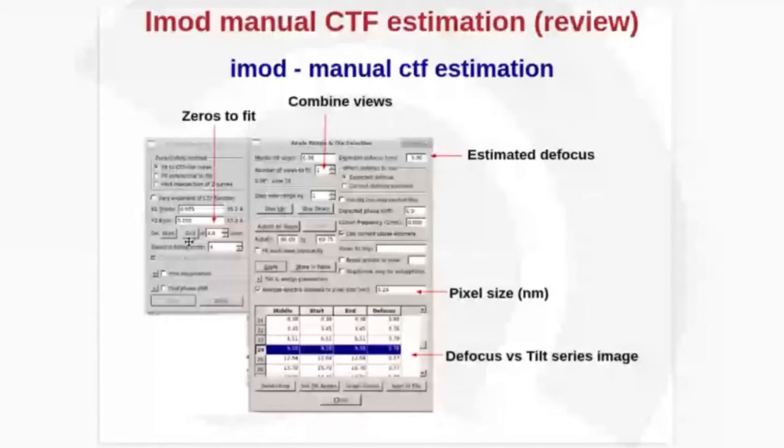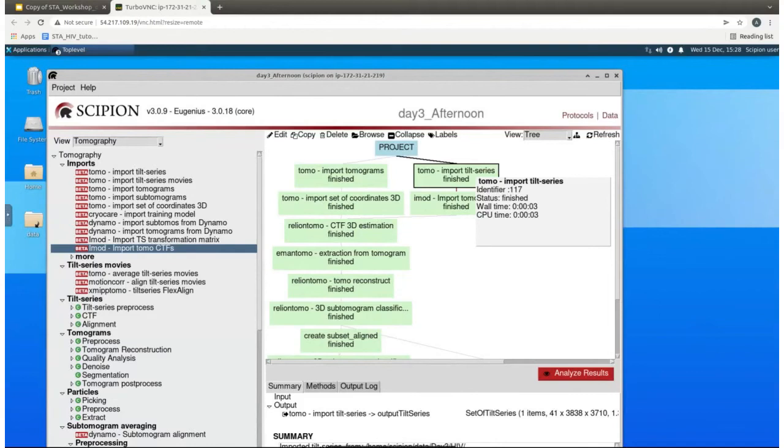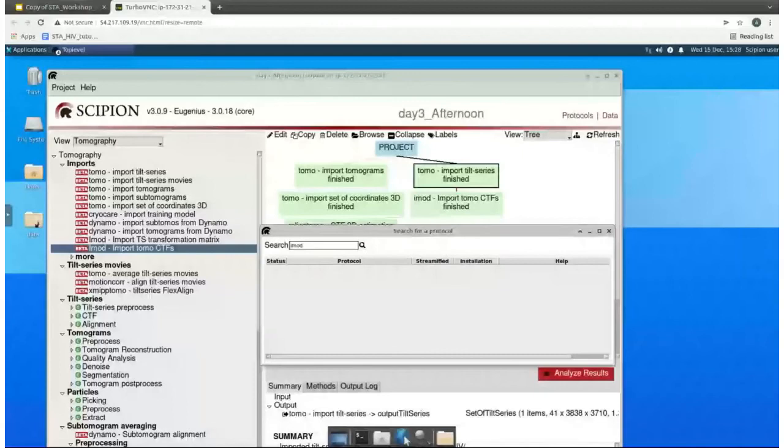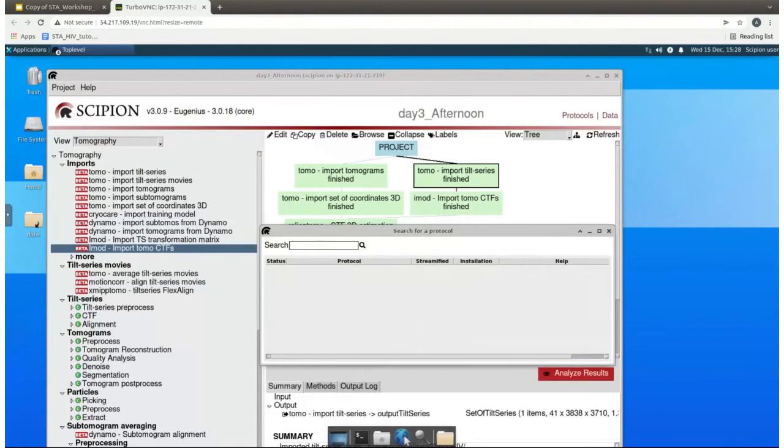Okay. So if we go to the machines, we got our tilt series here, and these tilt series are at bin 1. So the first thing that we are going to do is run being so careful and nice at the beginning. So we can do both. We can do first, so instead of, we are going like the tutorial. So we will search for IMOD normalization.